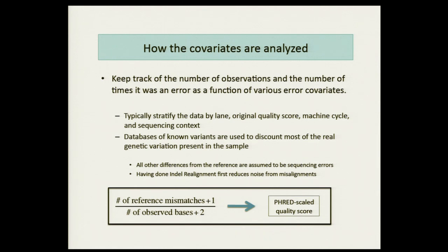So I have read a bit about people doing these sorts of things. So you may know about this project called the Genomes in a Bottle at NIST. It's trying to do this sort of thing. I don't know any specifics though.